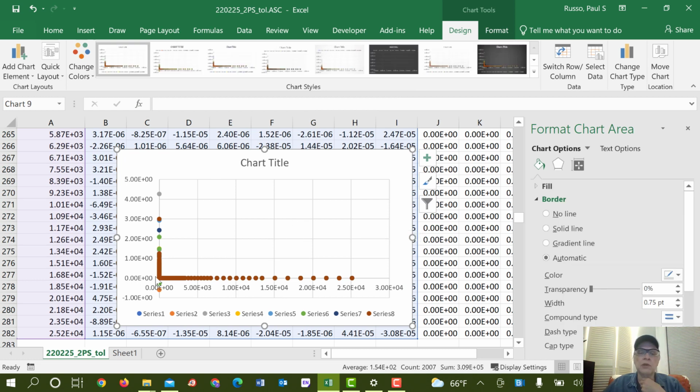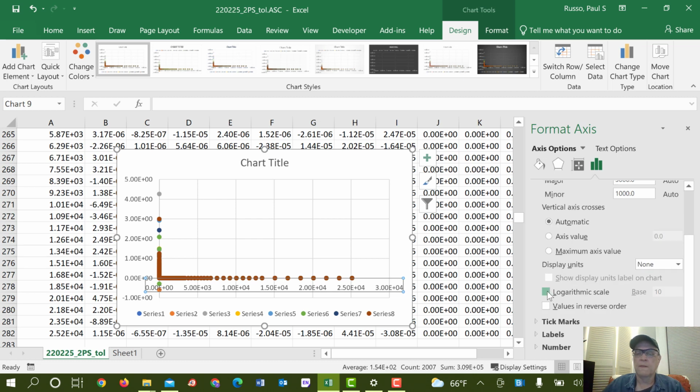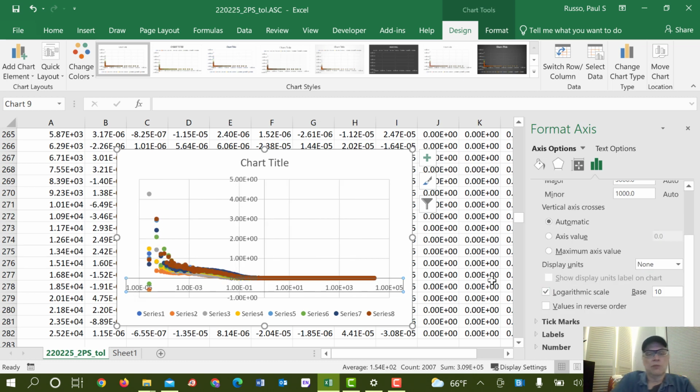Ugly looking thing because of the linear time scales. So maybe the first thing to do is to decide how much of this we're even going to bother with. Okay, this actually is an exponential decay, rapidly coming down. Let's actually just try to trim it a little bit, and I think it'll be helpful for this purpose to click this axis and make this be a logarithmic axis. And that looks a little bit more like it probably did on the correlator instrument's display.